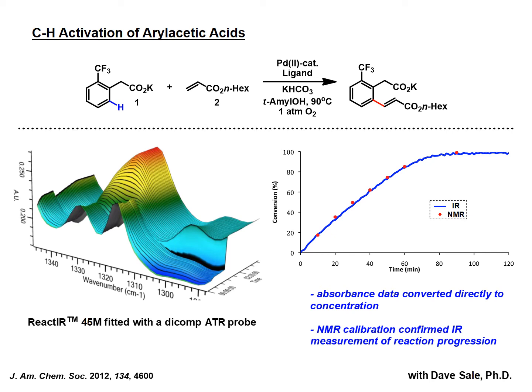And so I'm going to show you how to use RPKA from the data that you get. That's very simple, just consumption of your starting materials in your reaction. And there are two protocols you need to know about doing RPKA, a same excess protocol and a different excess protocol. And that's everything you need to know about running this kinetic method.